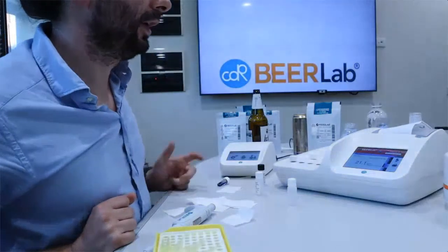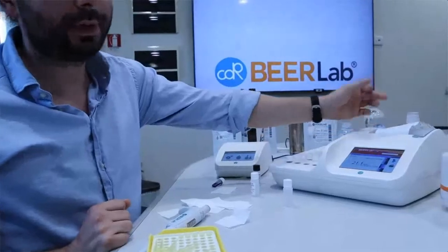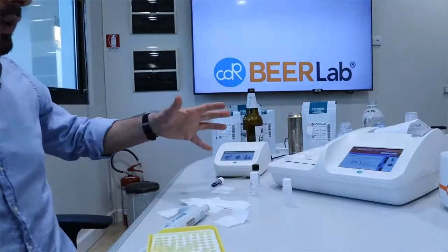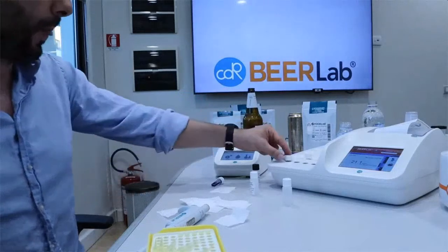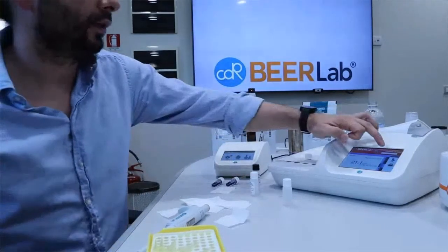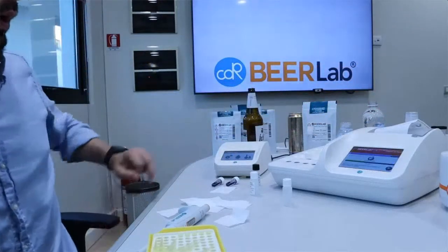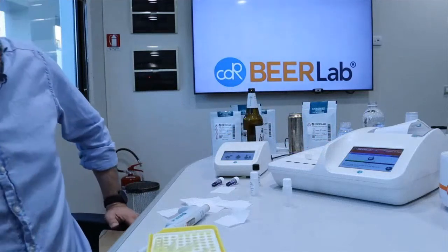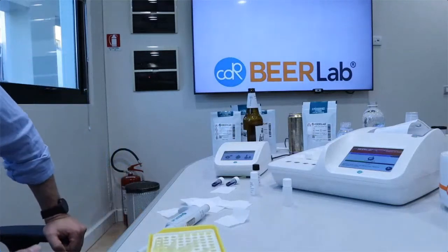And here we have the results printed on the paper or displayed on the screen. So all this while we are waiting for the results of alcohol. So now we can jump back to the alcohol analysis, and we can see that we have 5 minutes to wait. So I think in the meantime, if there are any, we can answer some questions.